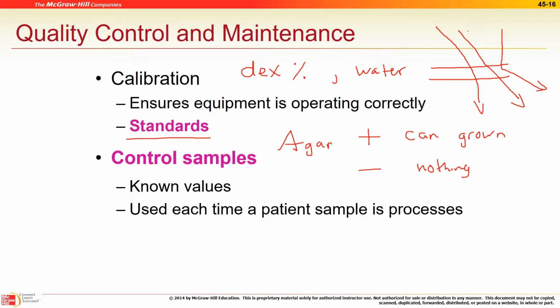For the negative control, we're just going to take it out of the packaging, tape it up, and label it as the negative control. Do we expect anything to grow on this plate? No, right? So nothing should grow, but if something grows on this plate, we cannot trust anything from that stock, because how do I know if the rest are contaminated? Right? Same with the positive control. If nothing grows on your positive control, then you're going to have to question the test media. Is it able to support life? So we'll run the two positives and negatives, and then you'll do your sampling today.